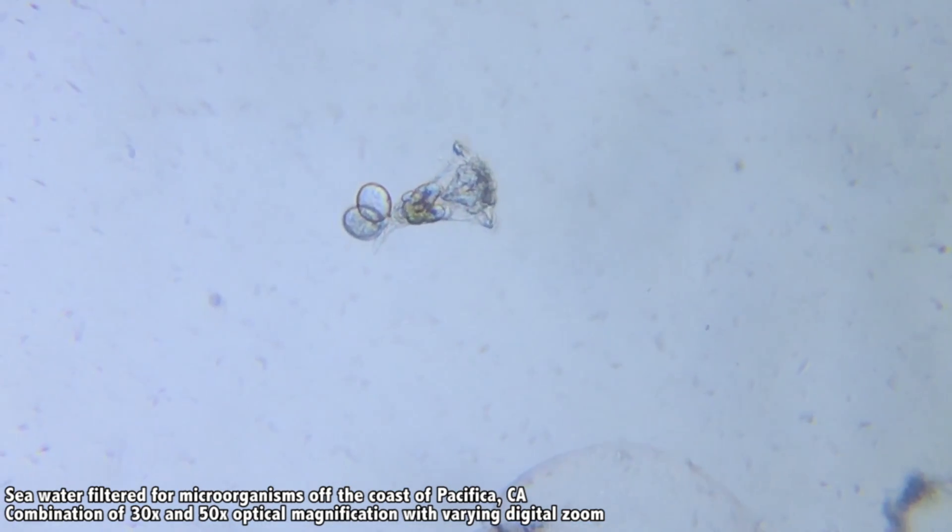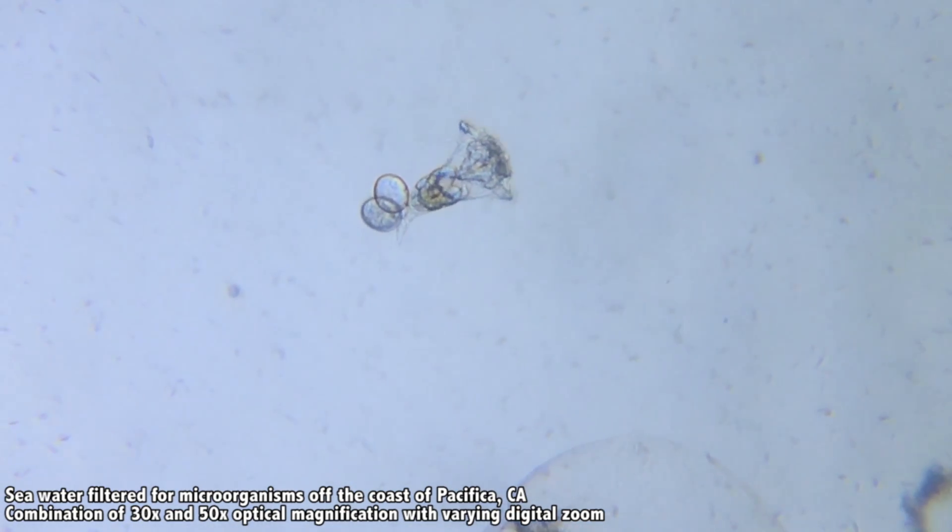And whenever you do find it, you can always take a closer look — take a photo, video, panoramic shot, slow-mo, or timelapse.